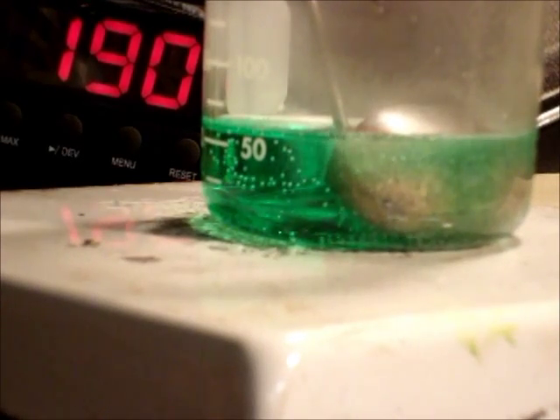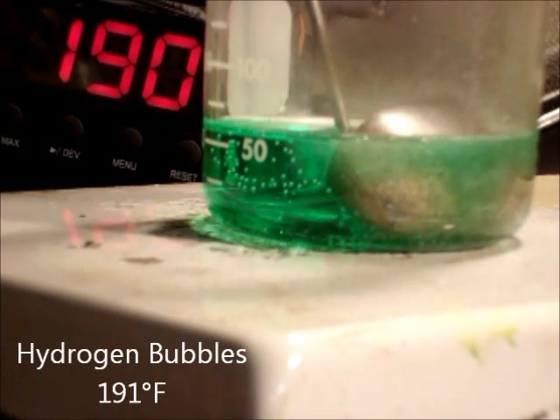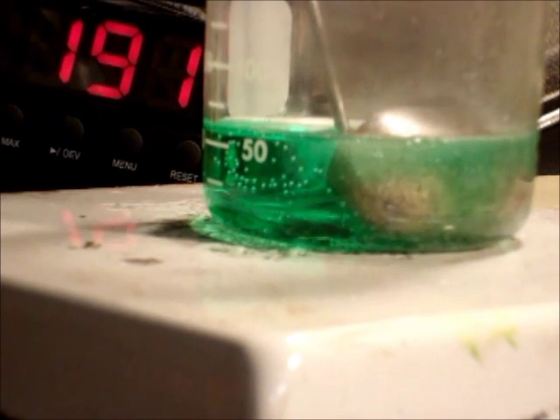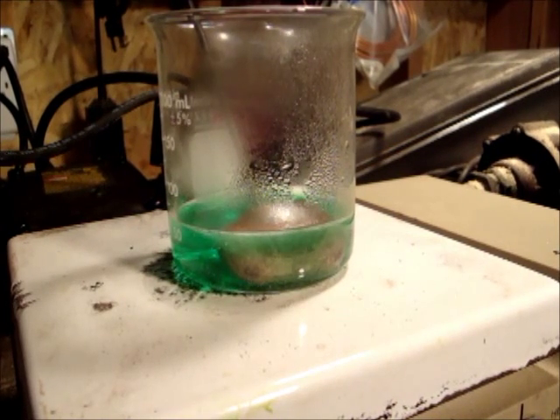Okay, there we are. 190 degrees, and I hope you can see there's quite a bit of hydrogen bubbles coming off there. Temperature's 191. Okay, we're going to try to get this up to boiling so you can see the difference between the reaction where there's hydrogen involved and nitric acid boiling. Okay, it's 5:44 p.m.